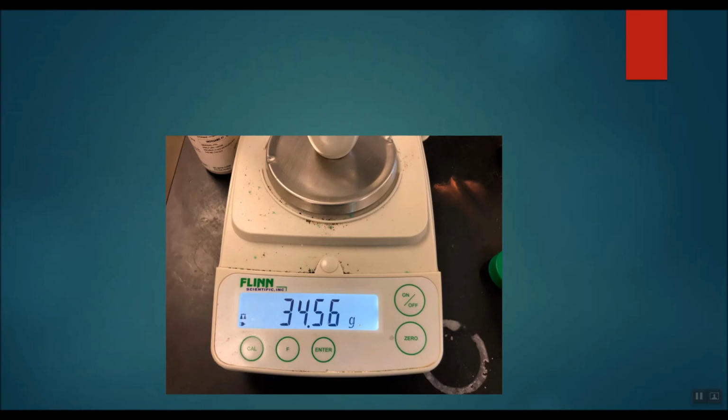Now, I'm going to let it cool off. Why? Because crucibles, because they're ceramics, tend to absorb a certain amount of water. So when we weighed the crucible originally, when it was cool, it had that water in it. So we weighed it with a little bit of water in it. Of course, when you heat up the crucible, that water evaporates, it goes away. But we need to let it cool so that the water will come back in.